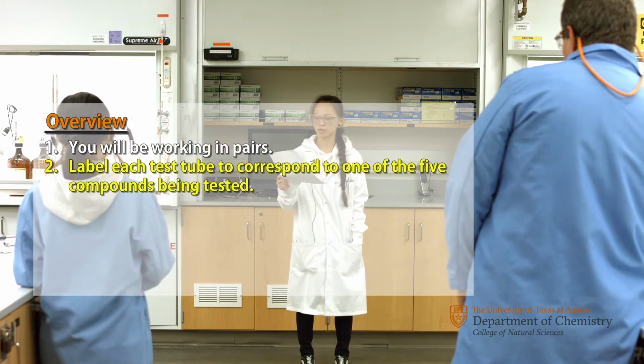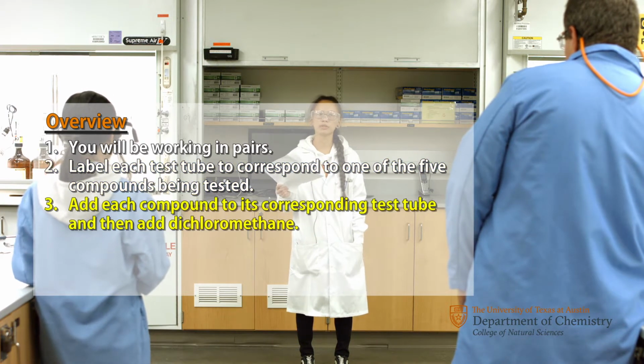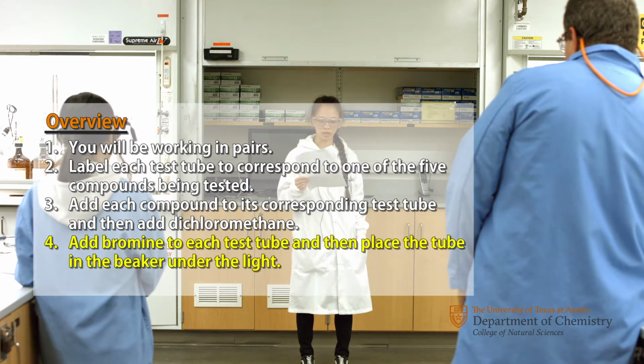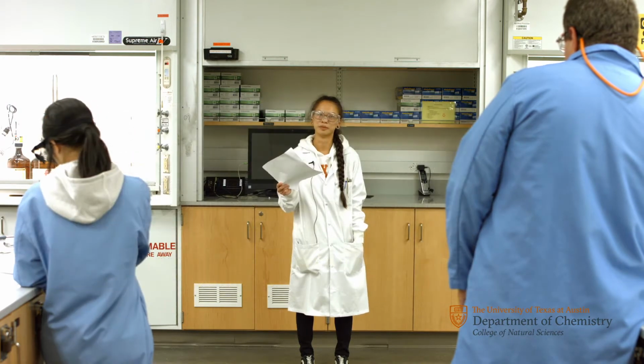Label each test tube to correspond to one of the 5 compounds being tested. Add each compound to its corresponding tube, and then add dichloromethane. Add bromine to each test tube, and then place the tube in the beaker under the light. Make sure you record the time it takes for the red color to disappear.